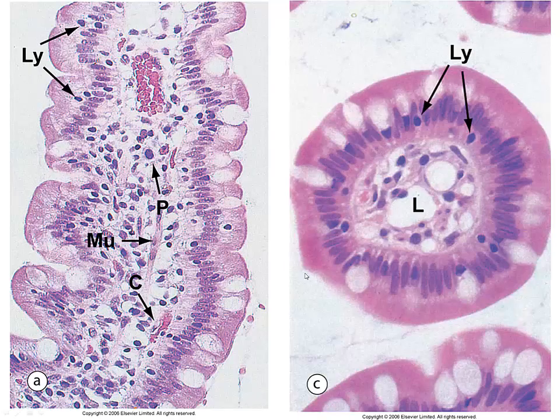At the light level, this is another longitudinal section. Again, our columnar epithelium. We're going to see increasing numbers of goblet cells as we get further down our alimentary canal. Here is going to be our lamina propria, a lot of plasma cells, lymphocytes. We've got some blood vessels here. We've got some smooth muscle here, and I'm not really seeing a good look at the central lacteal. In a cross section, we can see that central lacteal as a broad open area that's present in the middle of our intestinal villi.